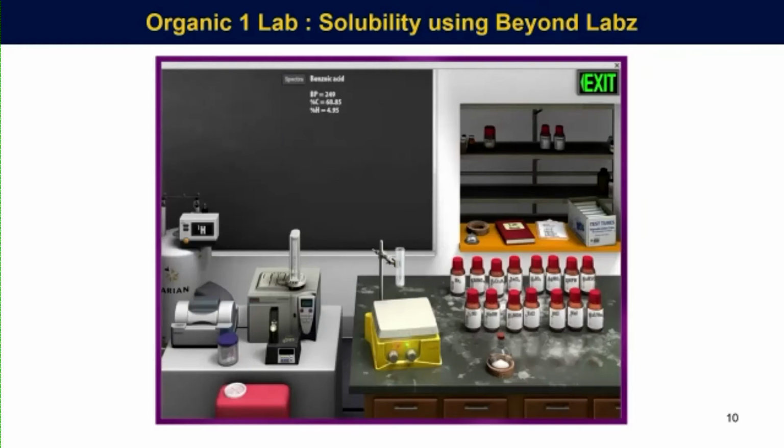And at this point in the lecture, they're learning about acids and bases. And now all of a sudden they're doing an acid-base reaction in a solubility experiment, as we would do in person. And they have to answer the question, why is this stuff dissolving? So now we're getting some chemistry as well as the physical process, and it's building up to what comes next, which is the idea of extraction. So this was good. This is a nice way to get started.